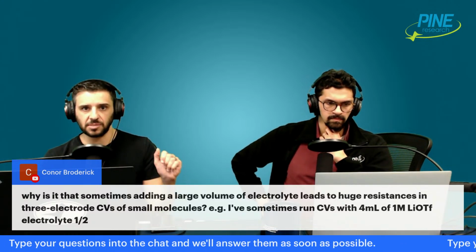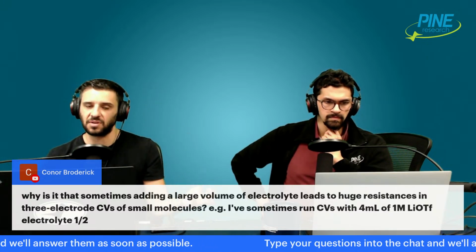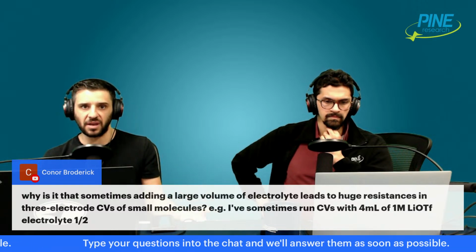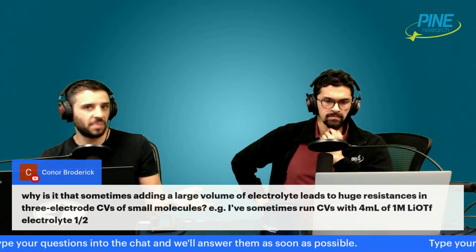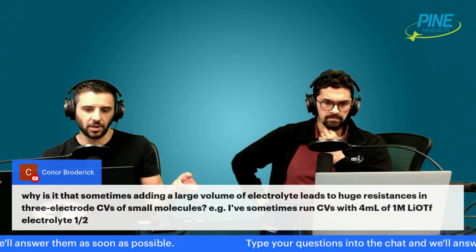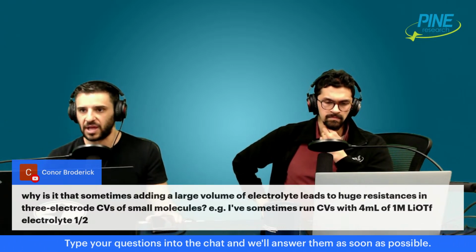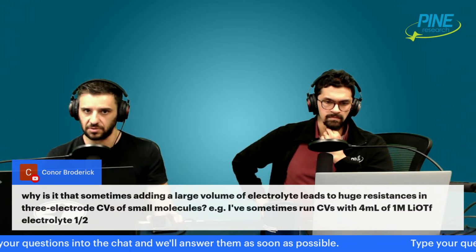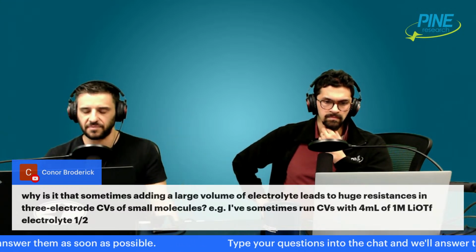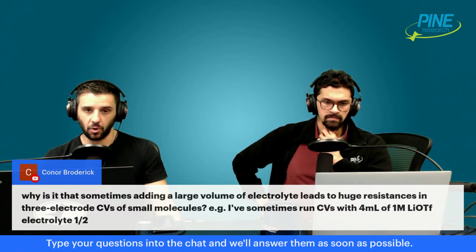So your resistances become so high if you just try dunking them into a 3 electrode configuration or a 2 electrode configuration with any appreciable amount of volume. The resistance is so high you basically won't get any intercalation or deintercalation. Your IR drop is so massive it eats up everything. You basically don't get what you're after. You're applying 3 volts, but it's really like 1 volt because you're eating 2 volts from IR drop or whatever. I'm making up these numbers obviously on the spot here, but proximity and pressure is required.